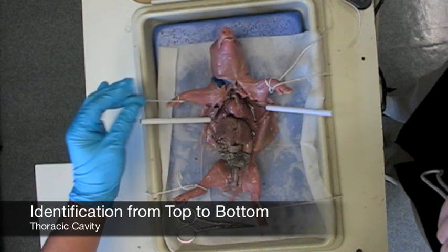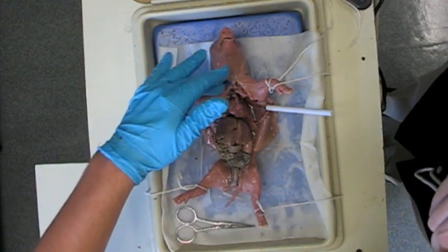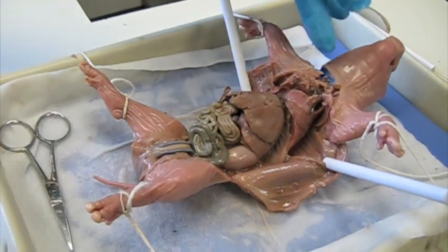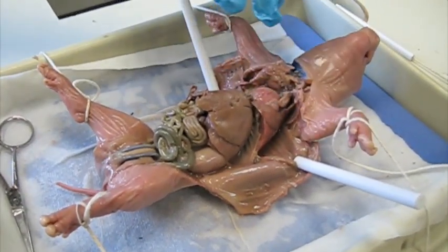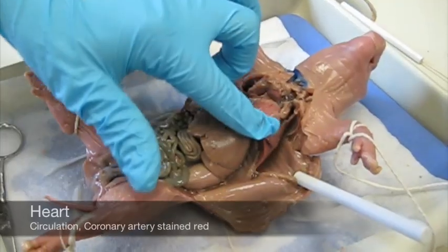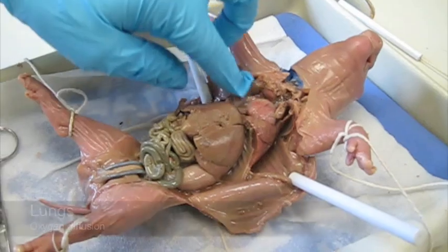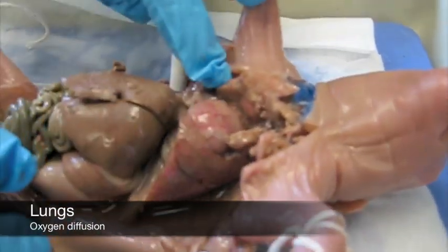Once you have got your animal fully cut open and exposed, you can start identifying the organs inside. From top to bottom in the thoracic cavity, this tissue around the top of the heart is actually the thymus. It was cut during our initial cuts and it is very normal to cut through some of the organs. Right below that is the heart with a very well displayed coronary artery right along the edge stained red. Around this is pulmonary tissue — this is the lungs, the left lobe and the right lobe.